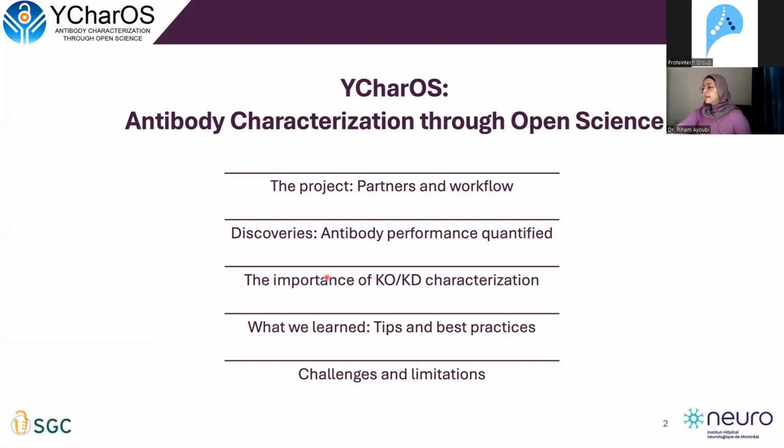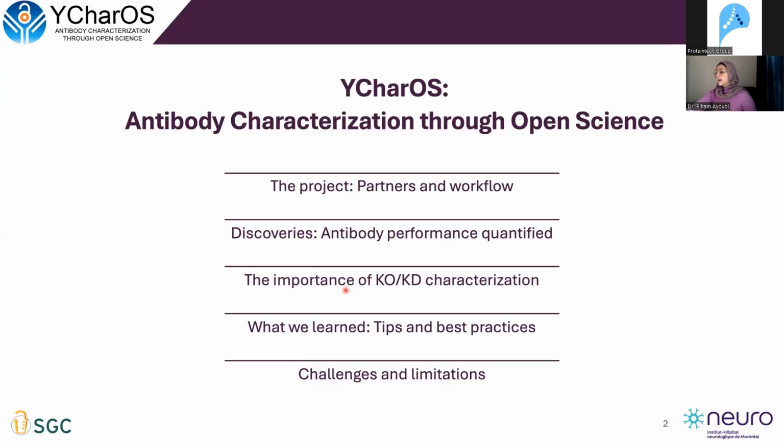I will highlight the importance of knockout and knockdown characterization and the importance of including knockout controls in our testing. And finally, I will also share some tips on how to choose and test an antibody.